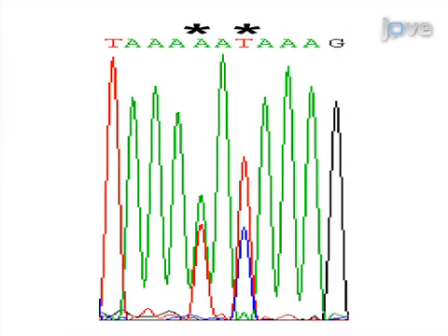Ultimately, the suppression of toxicity of the disease-associated substrate can be evaluated to identify the Hsp104 variants that are most promising for further characterization. The main advantage of this technique over existing methods like binding-based selections is that this technique allows for the selection of variants that suppress the toxicity of the disease-associated substrate.